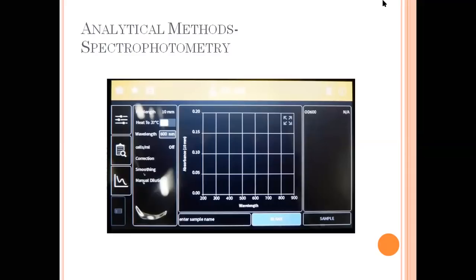So you have there the sample button, the blank button, the entering the sample name. You have also here yung parang bahay. Nababalik ka sa home mo doon sa ating first screen. You have here yung parang save icon. This is the method.